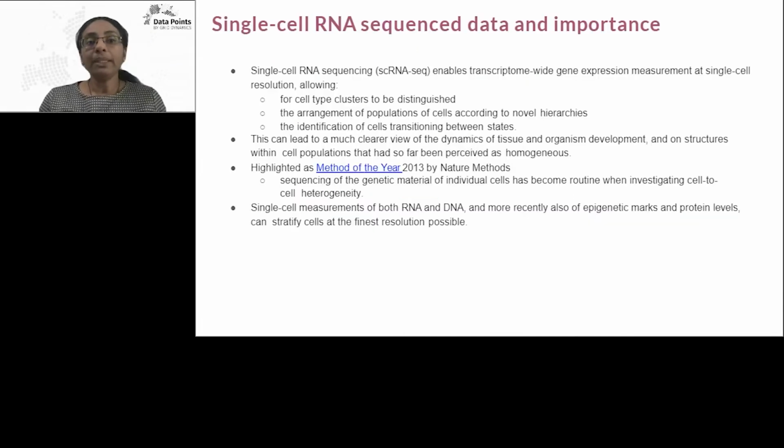So what is the importance of single-cell RNA-seq data? This helps you get transcriptome-wide gene expression measurements at cell resolution, from where you can identify cell type clusters, the arrangement of populations of cells according to different hierarchies, and the identification of cell transitions between states. It also gives a much clearer view of the dynamics of tissue and organism development and of structures within the cell population that were so far perceived as homogeneous.